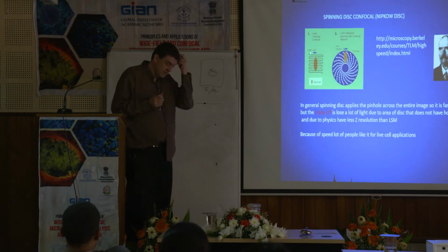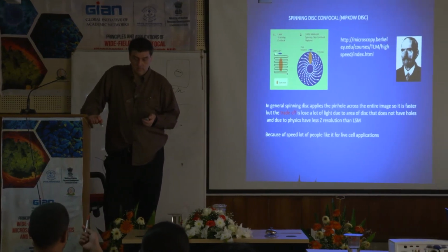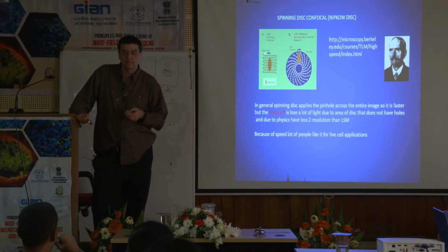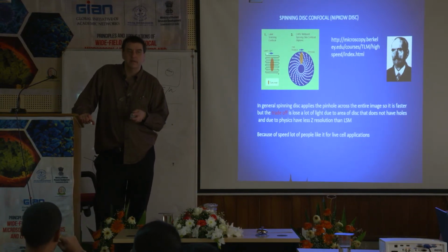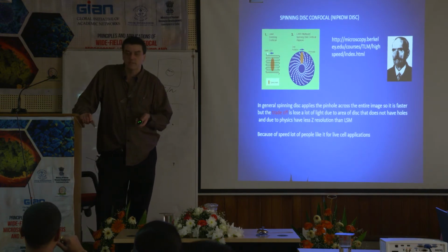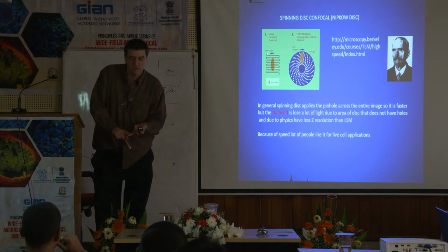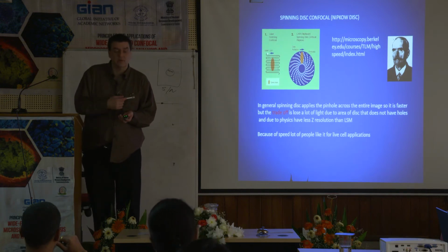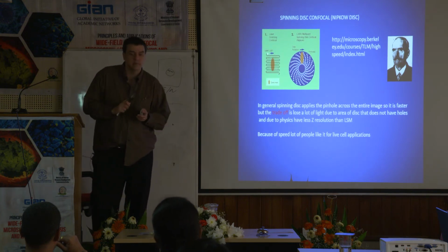Okay, so, yes? In case of live cell imaging. Right. It's harder to do. I mean, you can do it, but it's definitely much harder, because things are moving. You can do it, but you have to be quick about it. But it definitely doesn't work so well for live cell imaging. That's why a lot of times I do my live cell on a wide field, because the light's gentler, mostly because the light's gentler. But you can do live cell imaging on the confocal, it's definitely more difficult. Especially if things are moving really fast, you'll have a hard time with laser scanning.